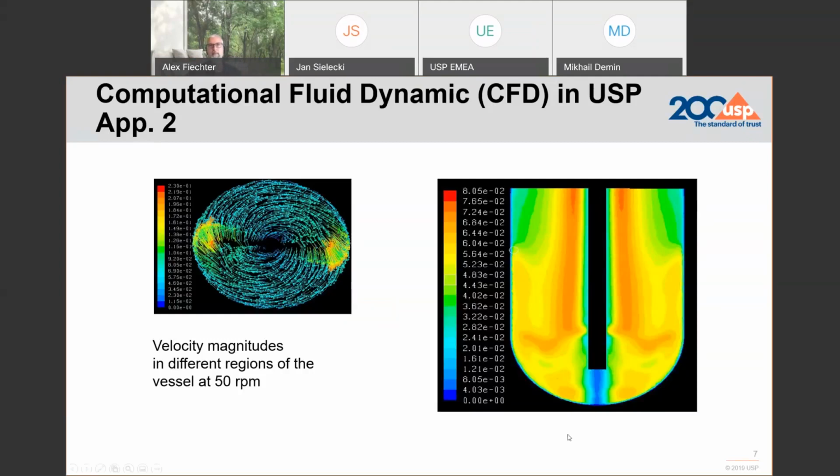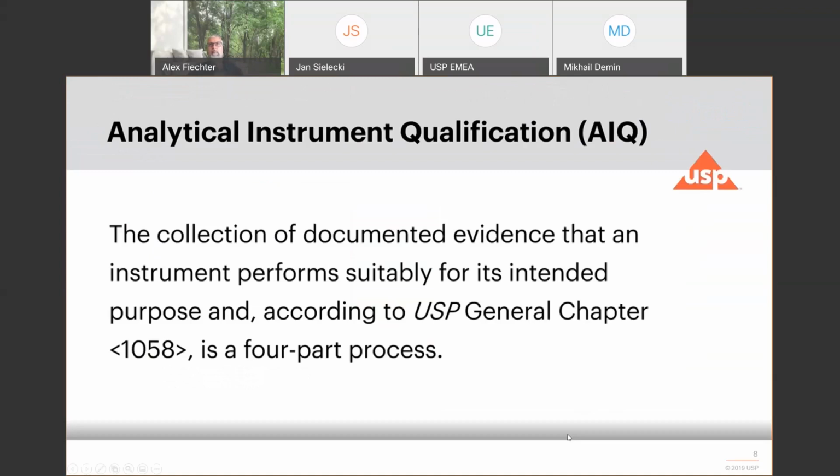This is essential. But before even doing the PVT, we are looking at the instrument qualification, the AIQ. And we have a chapter for that that is called 1058, which is an informational chapter. All chapters above 1000 are for information purposes only.